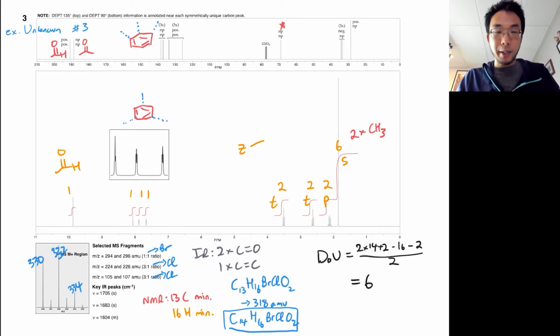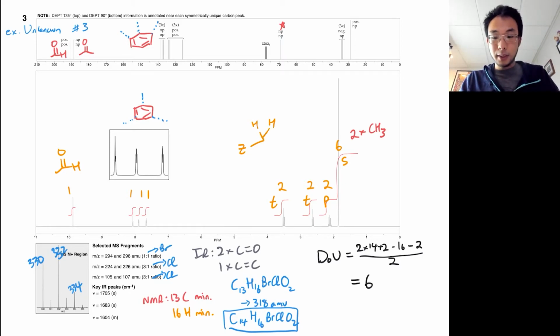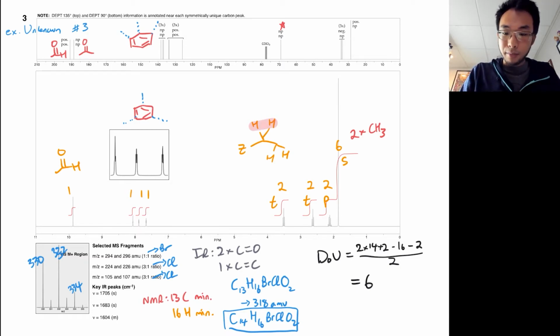Call it the electronegative atom. It's got to have 2 hydrogens on it. It has a signal that's a triplet because it is attached to another carbon with 2 hydrogens on it. In order for us to achieve a signal that's a pentet, this needs to be a pair of hydrogens, because the integration is 2, but a pair of hydrogens that themselves have 4 neighbors. Right? So kind of just by the way that I assigned all this, I can't have those be the pentet.